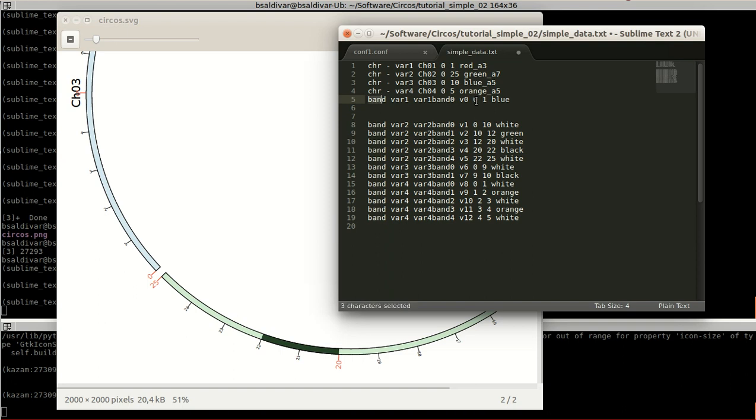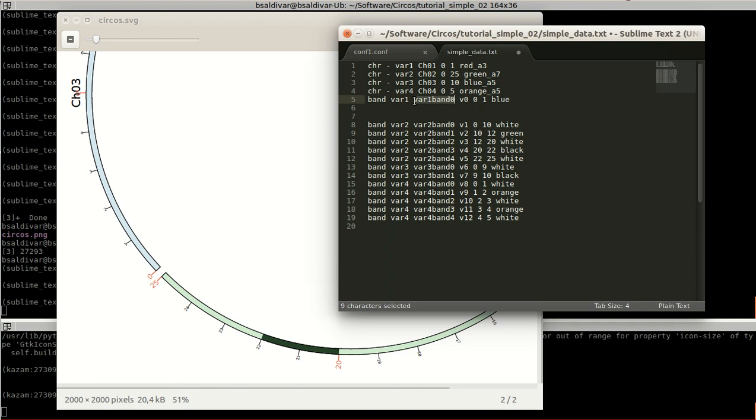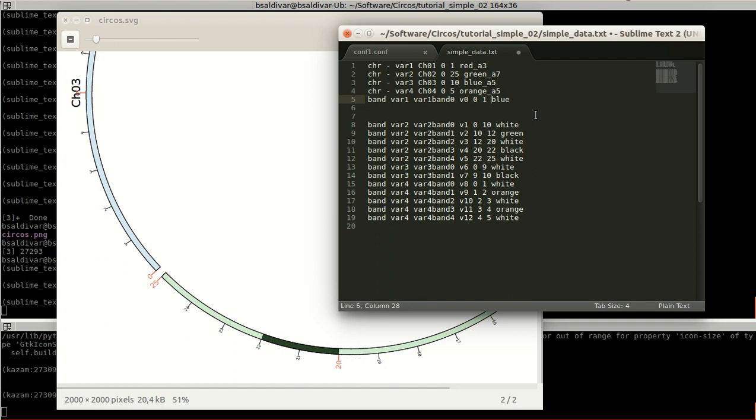The format is start with band, the word band, then the name of the karyotype variable name. In this case it's bar 1, then the name of the variable for the band. In this case the band is going to be called bar 1 band 0. And this other part here is supposed to represent the label but it actually doesn't work, so actually put anything here. The next two represent the start and the end of the band. And finally, the color.